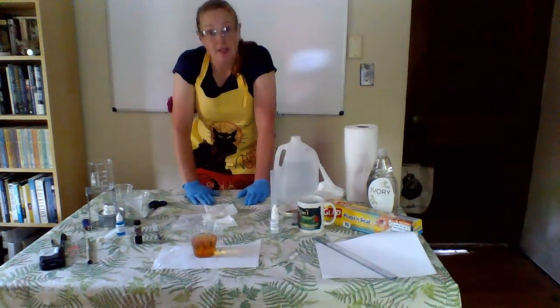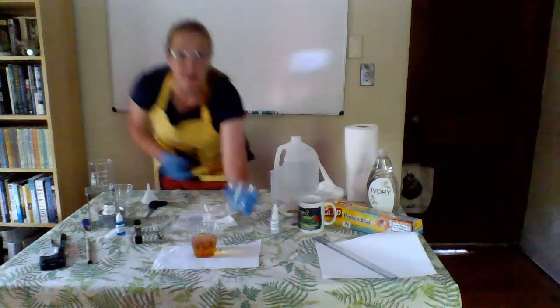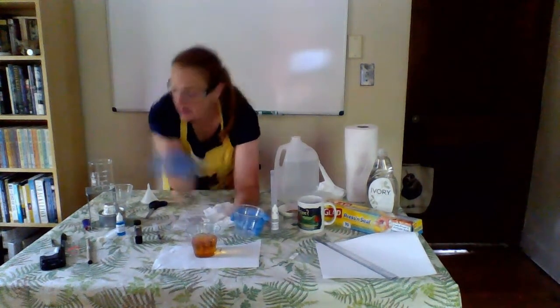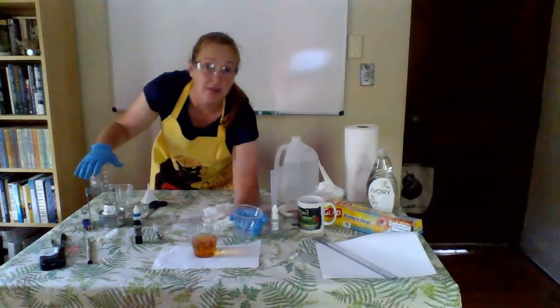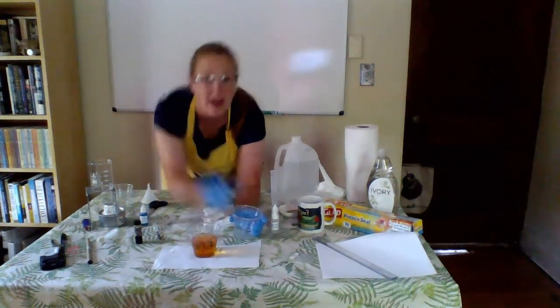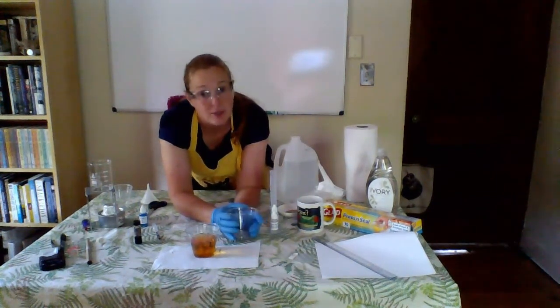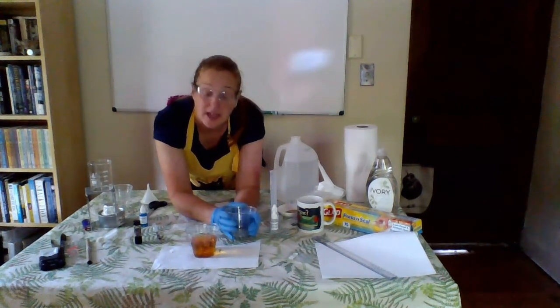When you are done with this experiment, you're going to be opening up your model cell and dumping the contents back into cup 2 to test, and that's where our Benedict's reagent, and in my case, the beaker and the flame is going to be important. Remember, I'm just using this to heat up my test tube with Benedict's to get this reagent to change and show me if I have any monosaccharides in my test tube. So follow those end protocols to get the end results and the end data.